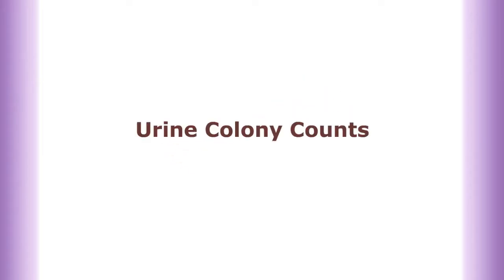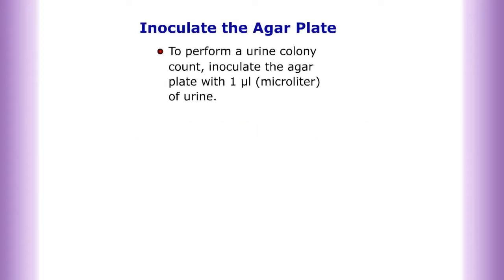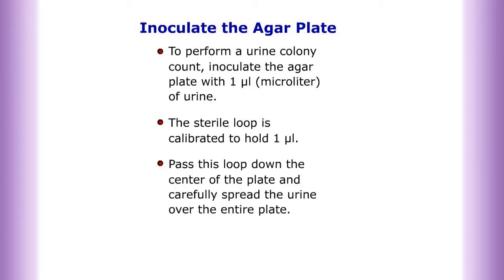Urine colony counts. To inoculate the agar plate and perform a urine colony count, inoculate the agar plates with one microliter of urine. The sterile loop is calibrated to hold one microliter. Pass this loop down the center of the plate and carefully spread the urine over the entire plate. Incubate the plates overnight at 37 degrees Celsius.